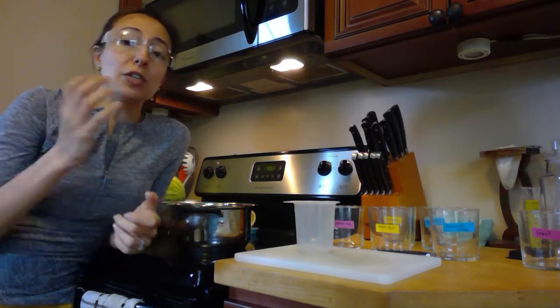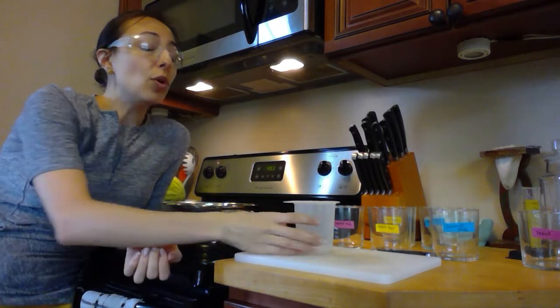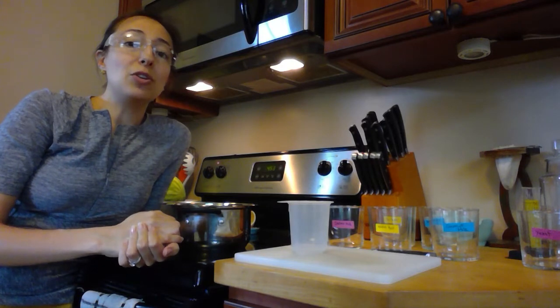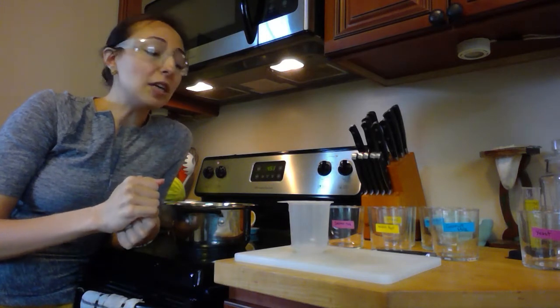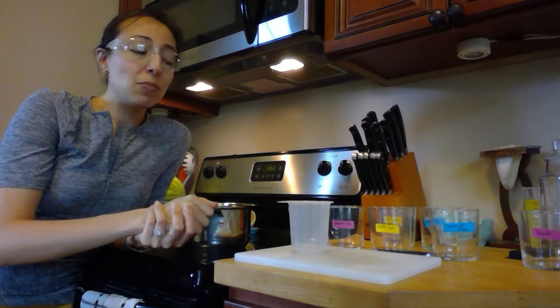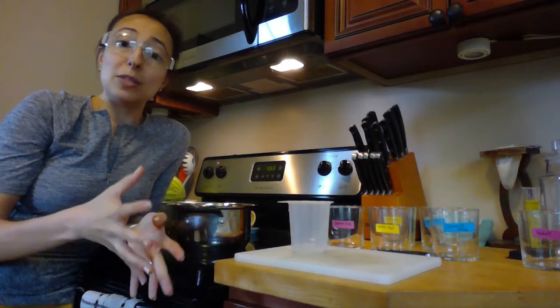Now, if you're using very strong acids or very strong bases like bleach, please be careful with it. You only want to add a little splash. And it's always best if you make sure that you're pouring very slowly so as not to splash any of the chemical up in your face. We always say it's better to add the water first and then pour a little bit of the bleach on top so that you don't actually splash bleach when you're adding all of the water from the sink. But either way, however you do it, please be careful.